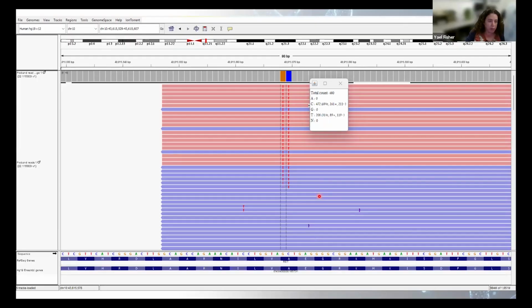Since in this case we have an alteration of 2 base pairs, if we want to confirm that it's real, it's helpful to look at where they are. So in all of these, they always come together. It's always GC that turns into TT. If this was spontaneous deamination of this C, for instance, then we would not see it in exactly all the reads that have this G to T alteration.